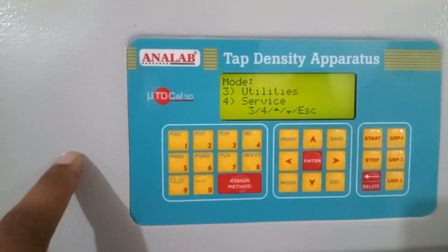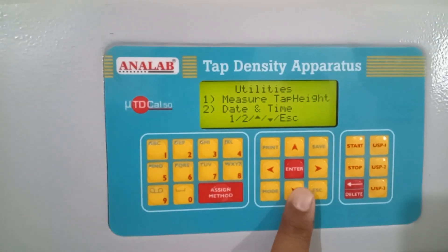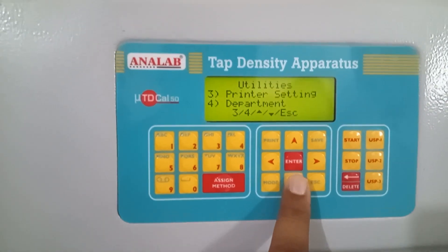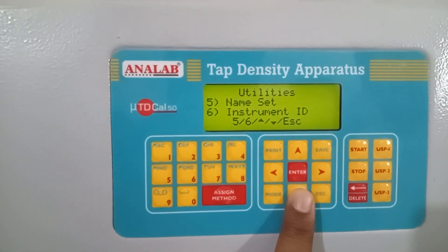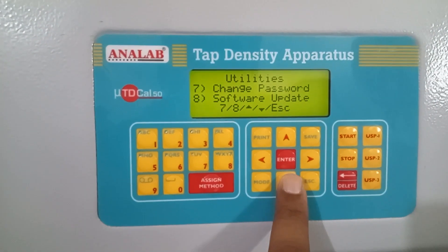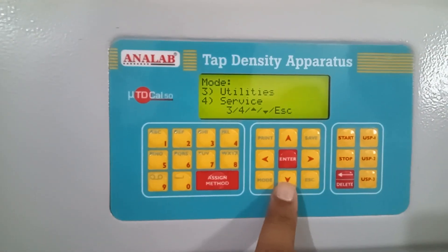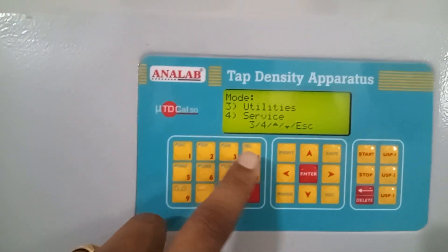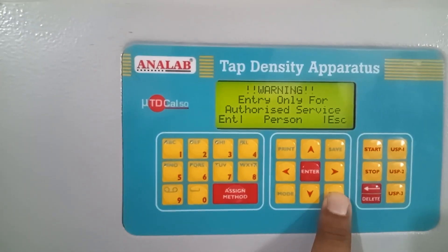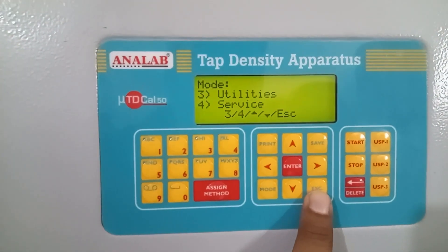The next option available is utilities. These are multiple settings available for the instrument — that is measure type height, date and time setting, printer setting, department setting, name ID, and instrument ID. All these things can be updated from this menu, including software update. The next is the service menu, which will ask for a password — this menu is for the manufacturer or service person and is not used by the user.